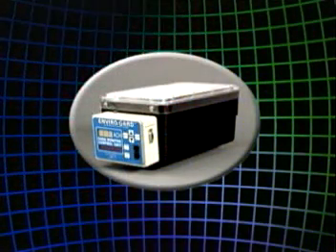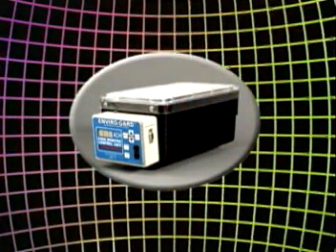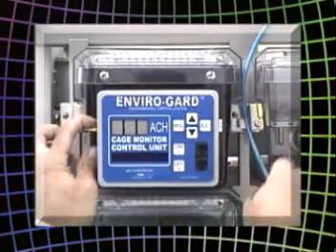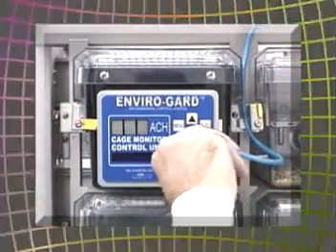Our EnviroGuard cage monitor control allows you to maintain and certify precisely what's going on inside your AllerZone micro isolator cages. Now you can certify the balanced airflow of your own ventilated racks and cages.